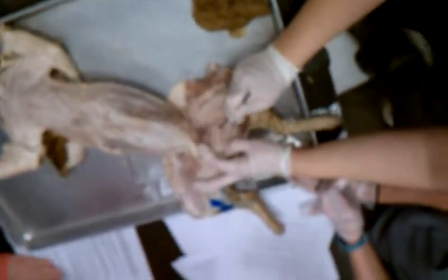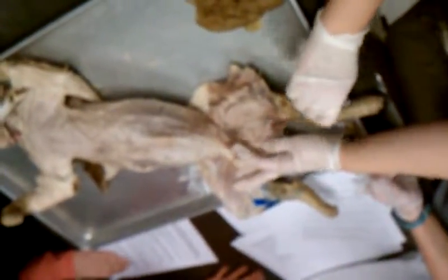Okay. So with the line right here, below that line, you have 3 muscles, right? And hint here, 2 out of the 3 start with the name adductor, okay? So this long, skinny one you see right here is most toward the inside. This is the adductor longus. So I remember adductor longus because it's the long, skinny one. This one right next to it, this guy right here, is the adductor femoris. And then this big one that kind of looks like a chunk of white meat from a chicken thigh, this right here is the semimembranosus. Okay? And that's it.